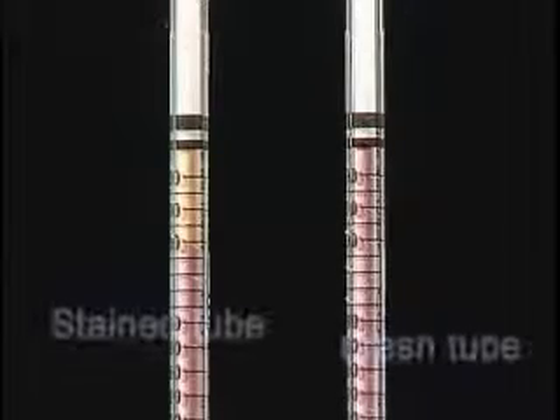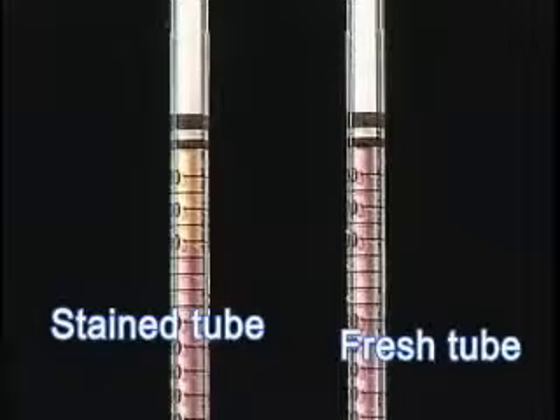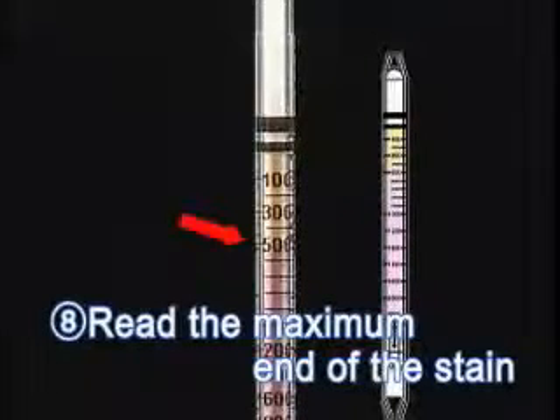Read the maximum end of the stain against the printed scale on the detector tube. For tube 126SF, the colour changes from pink to yellow. If the end of the stain is between graduation marks, estimate the concentration. The concentration of carbon dioxide in this sample is approximately 500 ppm.